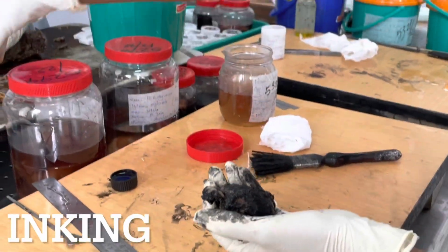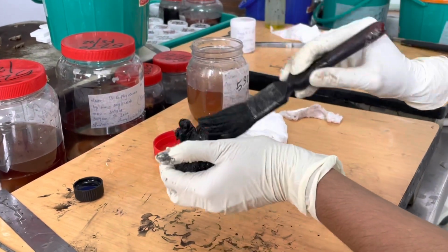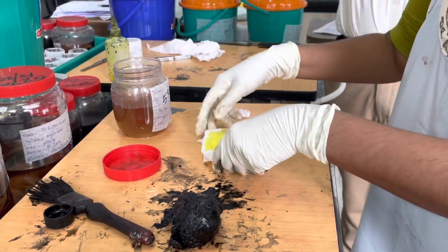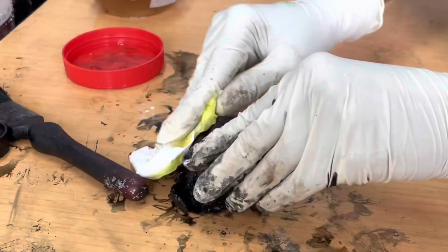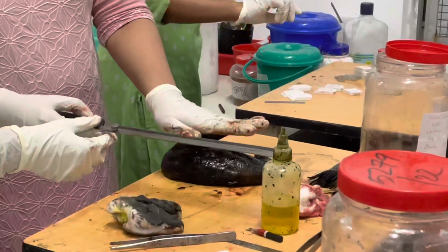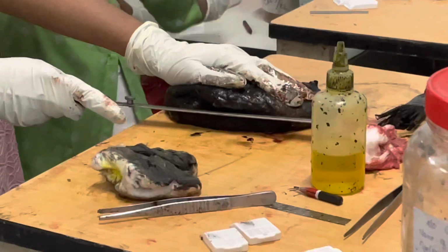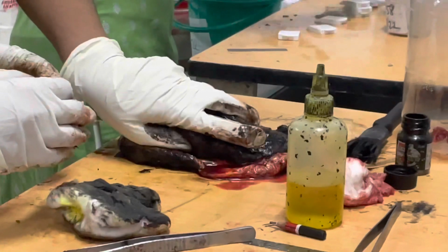Inking is the process that is done for the identification of the resected tumor margin. Gross processing or grossing is the process by which pathology specimens undergo examination with the bare eye to obtain diagnostic information, as well as cutting and tissue sampling in order to prepare material for subsequent microscopic examinations.